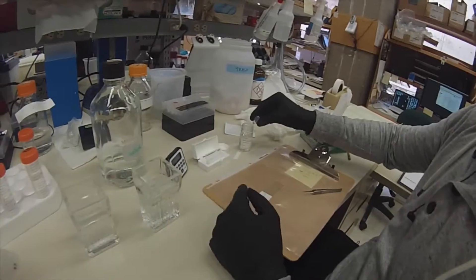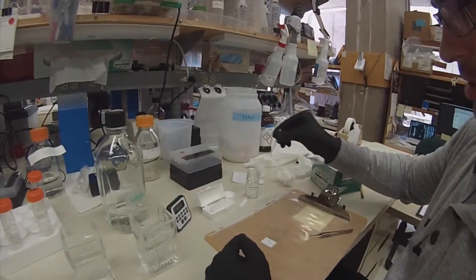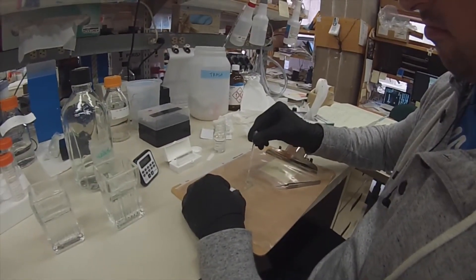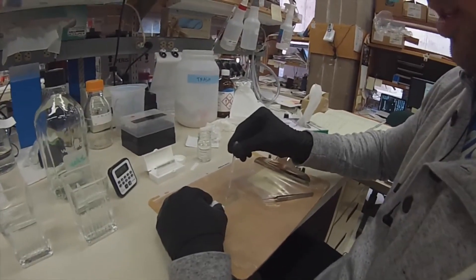We're using Floromount G, and I completely fill a pipette up. Then I'm going to be placing three drops, which seems like a magic number for me. So three drops go on the slide.